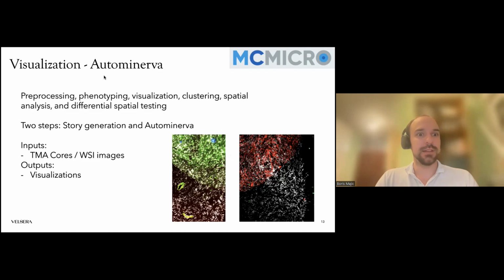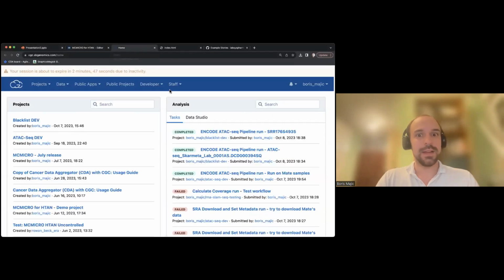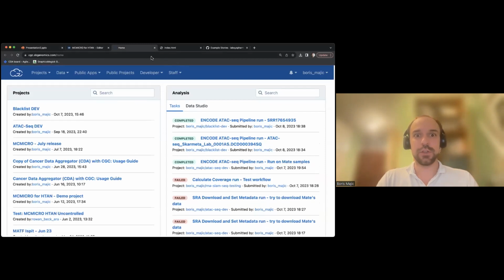This is it for the presentation, and now I will move to CGC and show you how you can get MCMICRO to one of your projects. As Cera said, there are two ways to get MCMICRO.